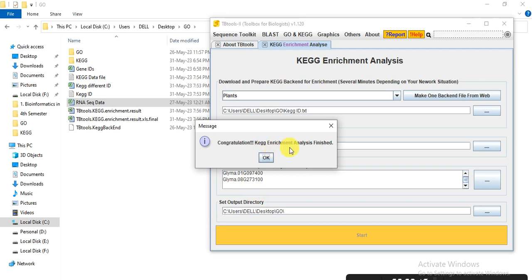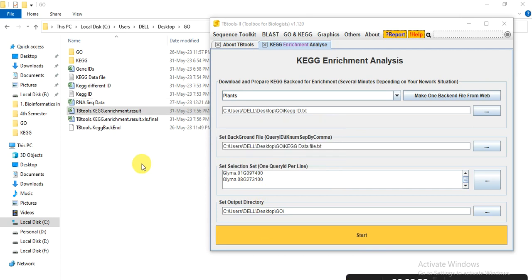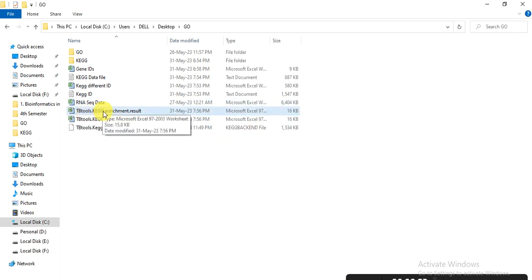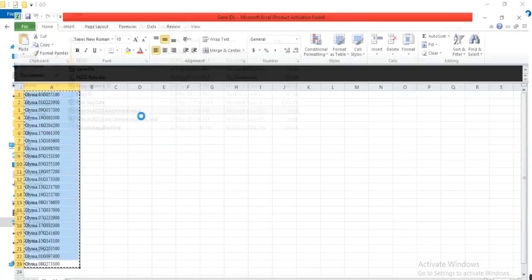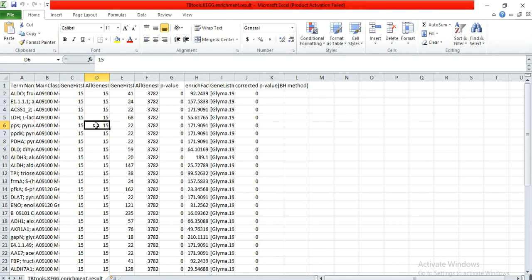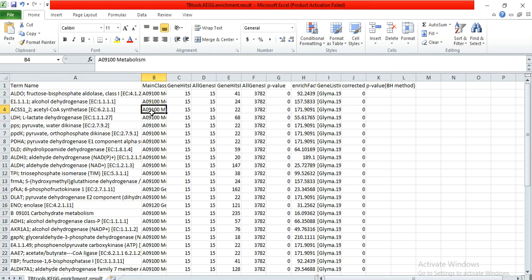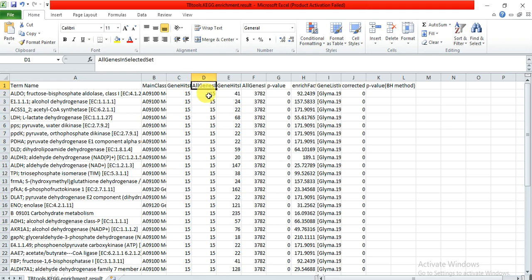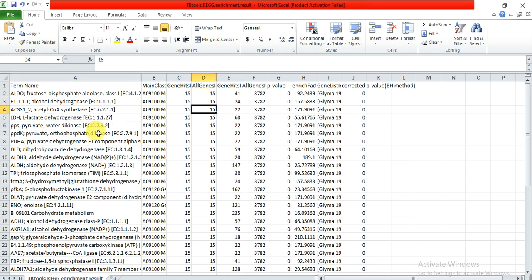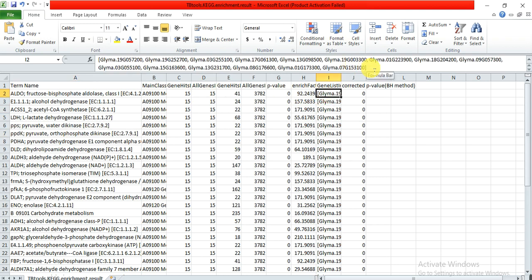Congratulations, KEGG Enrichment Analysis finished. Click OK, and then this is the TBTools KEGG Enrichment Results — open that file. Here these are the pathways in which the genes are involved. These are all the genes — about 15 genes are involved in this pathway, and these are the names of those genes.